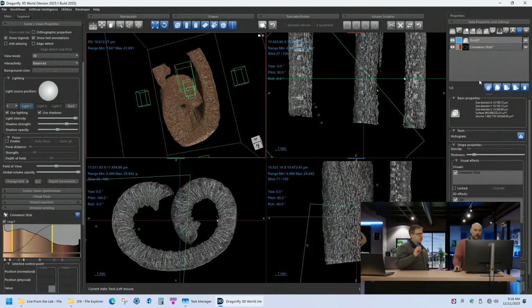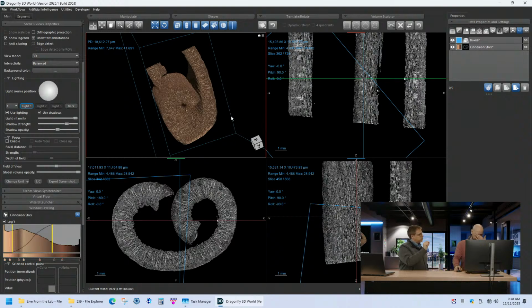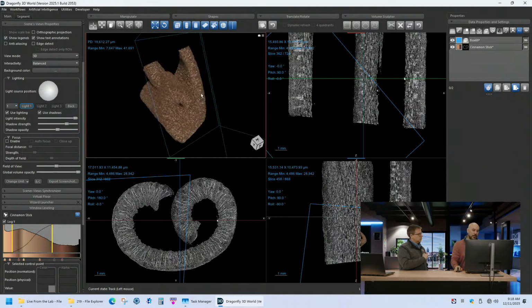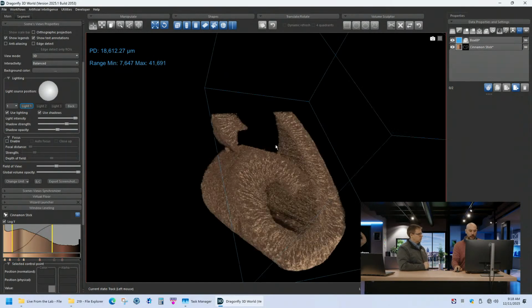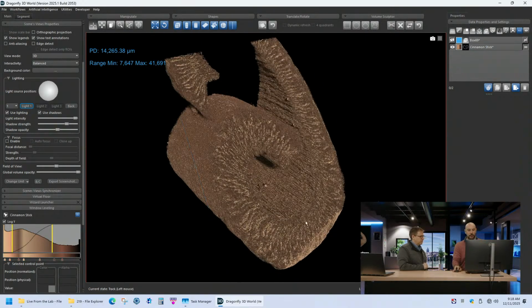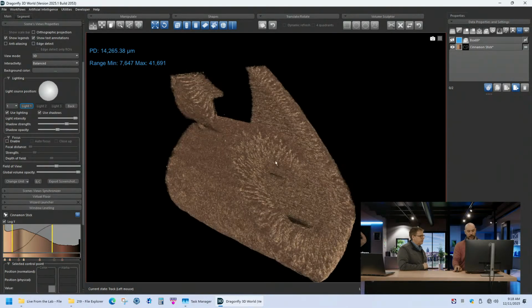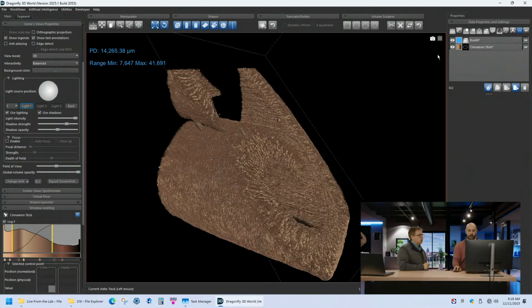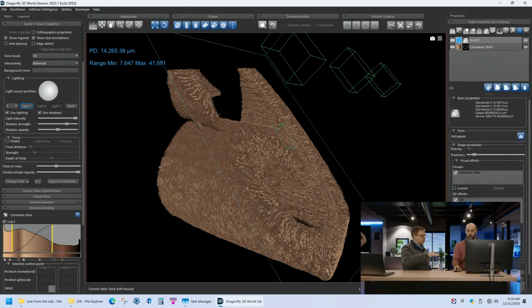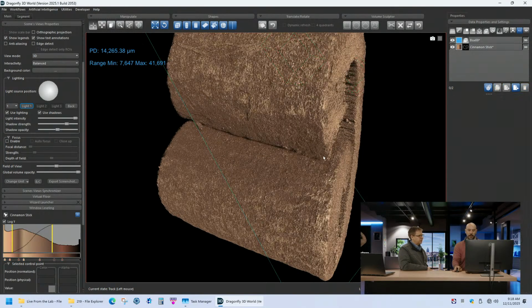One thing that might be a little confusing to people is that when you were clicking the eye on the box, we saw the box go away, but the clipping was still present. So if you want to take a screenshot, let's say we have this where we like it now, and we wanted to get this screenshot. We can now make the box go away, and this is a nice picture without that clipping shape in there. But if you did want to turn off the clipping, you'd actually have to click on the box, and then go down and disable that. Or you can just tell it to not clip on the box.